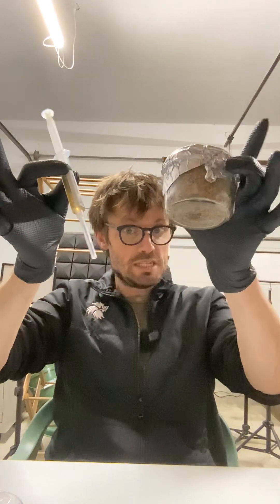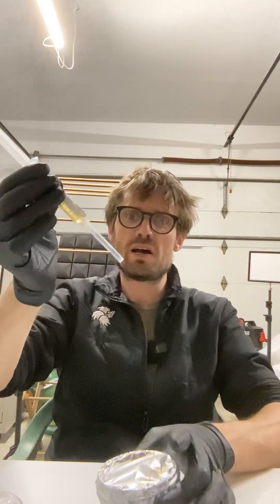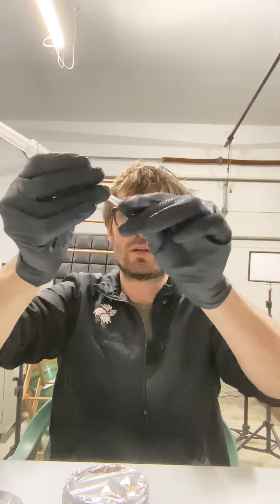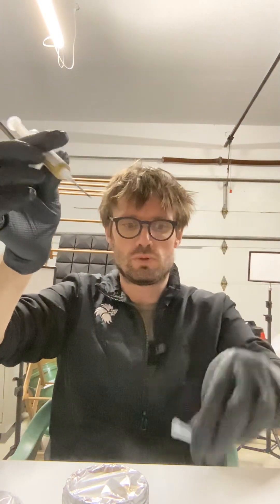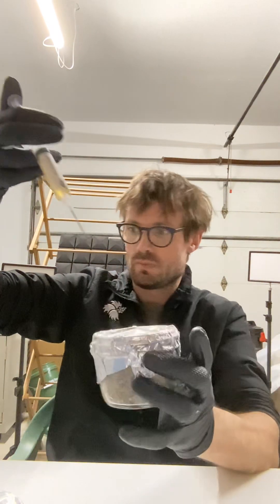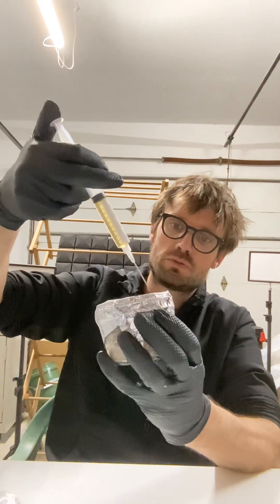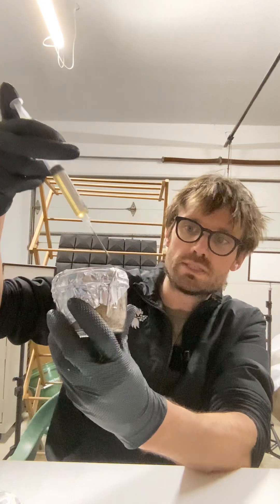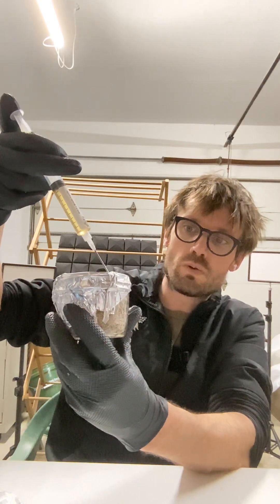I'm going to put some reishi spores into my brown rice flour cakes. I've got the laminar flow hood going on. I'm going to put one milliliter into each. Although I've got 12 here, I'm going to angle it so that the spores end up on the edges — that way I can also tell where it is.